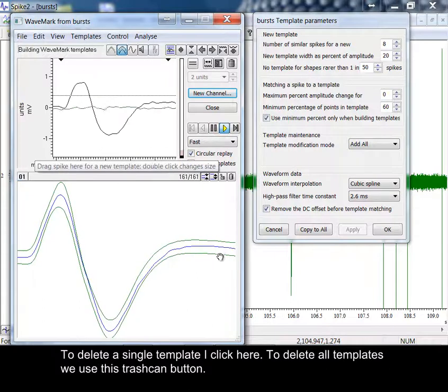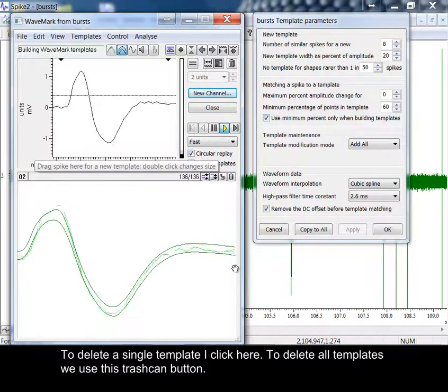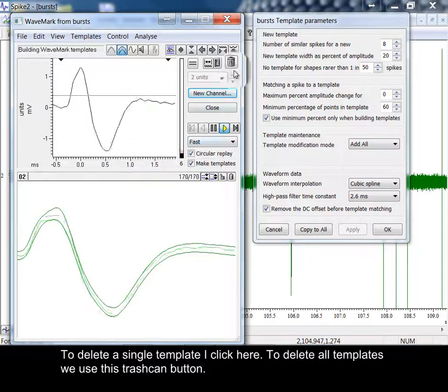Slight adaption of the template can be seen at the right-hand edge of this template window. To delete a single template, I click here. To delete all templates, we use this trashcan button.